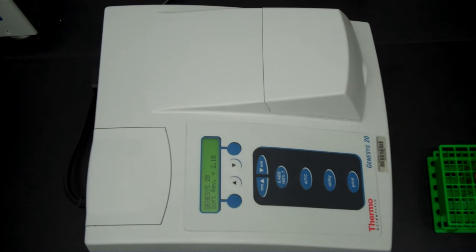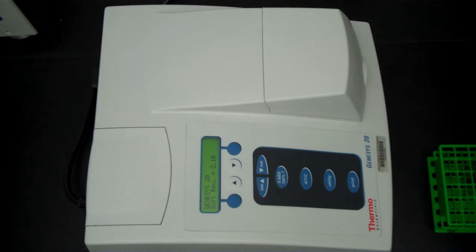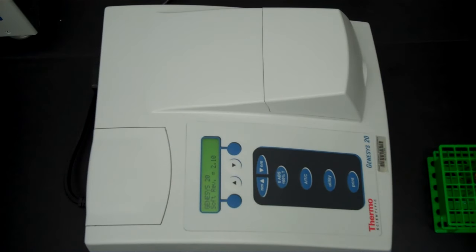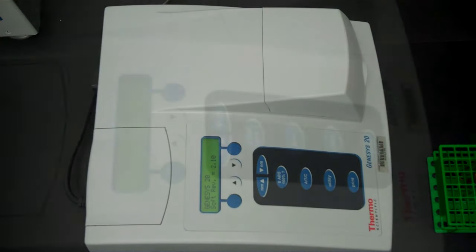Once you turn it on, if you look in the window, it will begin its initialization process and this can take several minutes so we're going to wait for this to happen.